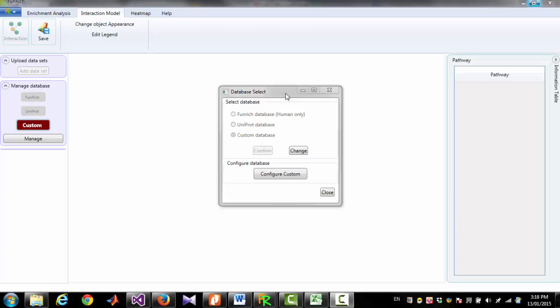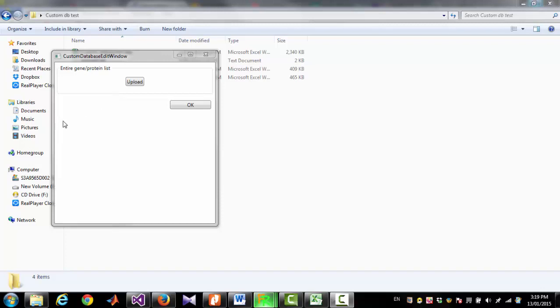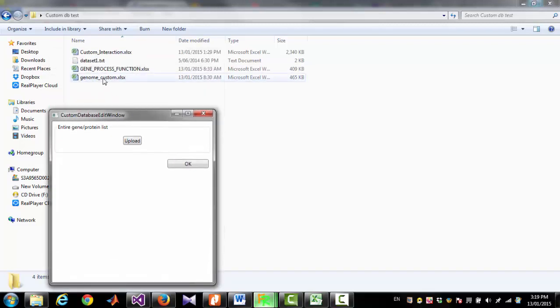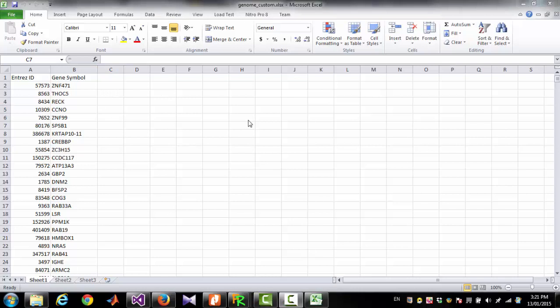To upload your file as a custom database, you have to click 'Configure Custom.' First, you have to upload the entire genome or proteome list. I am going to upload this file. This file has two columns: one is Entrez Gene ID and another is gene symbol. But you can upload a list of gene, protein, lipid, or anything.